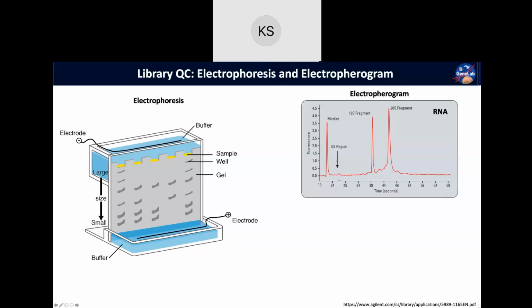And so here, as these are coming off, of course, if we have an RNA sample, if we did not clean it up or remove ribosomal RNA, that's going to be the biggest things we see, right? Because we just saw that over 90% of the RNA in our cells is ribosomal RNA. We know that there are 3 distinct ribosomal RNA fragments. We have this really small 5S fragment, followed by the larger 18S fragment, and then the largest 28S fragment. We'll see these nice, very large, very distinguishable ribosomal RNA peaks when we look at an electropherogram of just total RNA that hasn't been cleaned up or filtered.